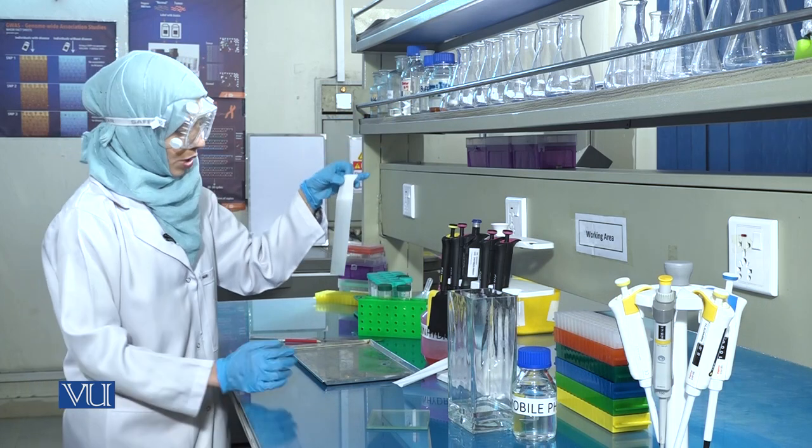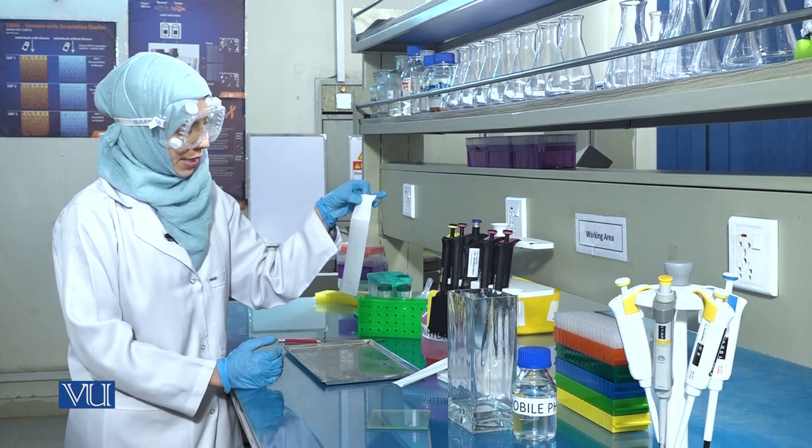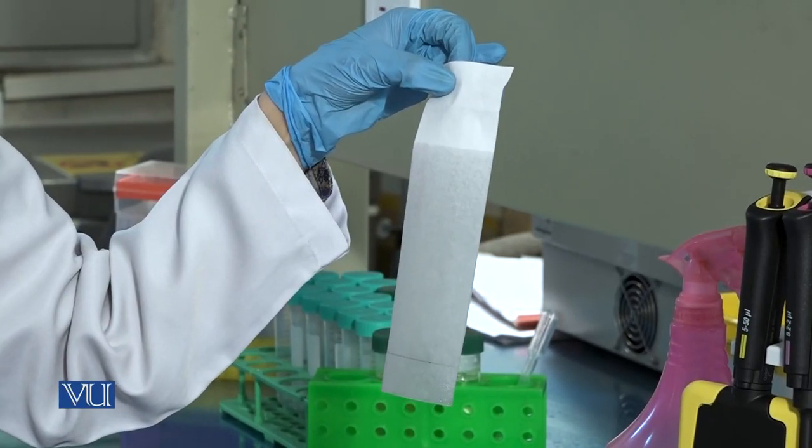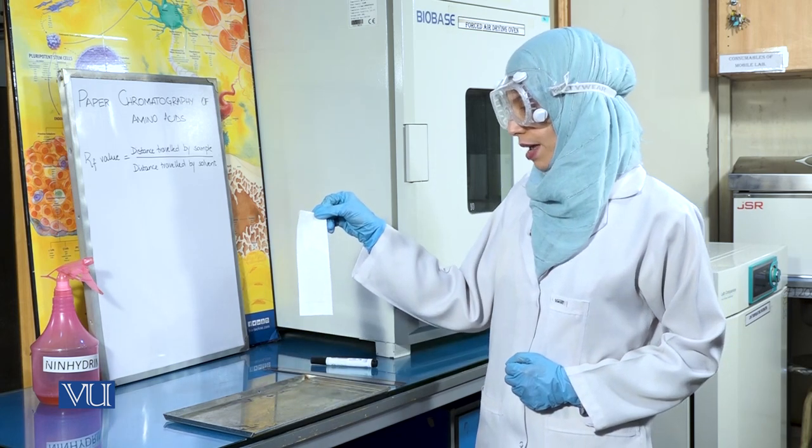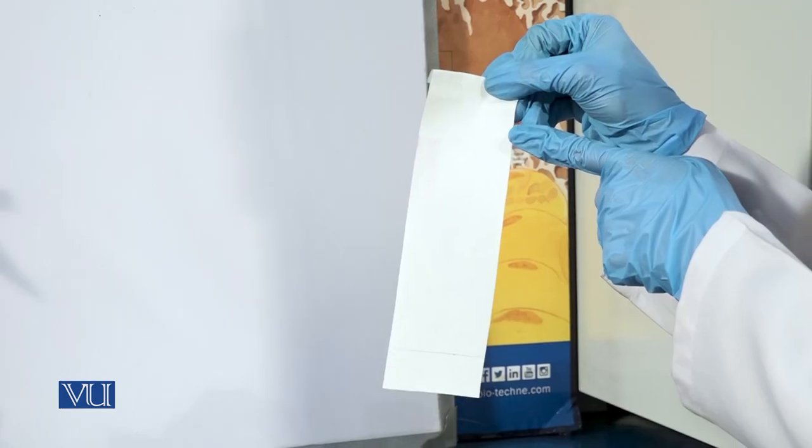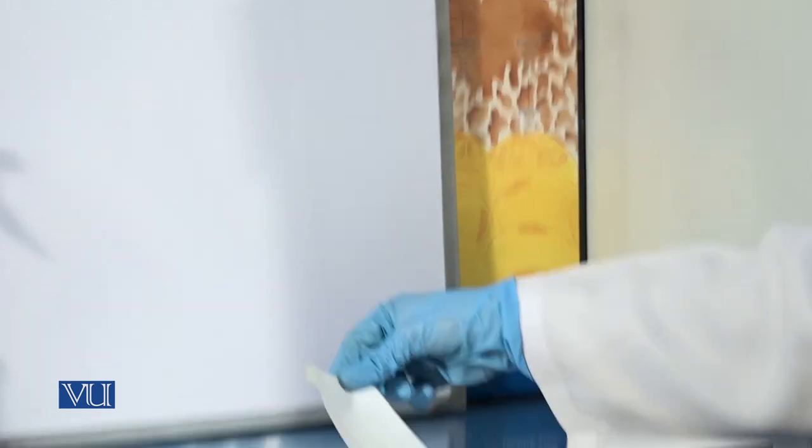Allow the chromatogram to dry completely in the air before moving on to the next step. Once the chromatogram has dried completely in the air, mark the distance travelled by the solvent with a lead pencil. This is known as the solvent front.